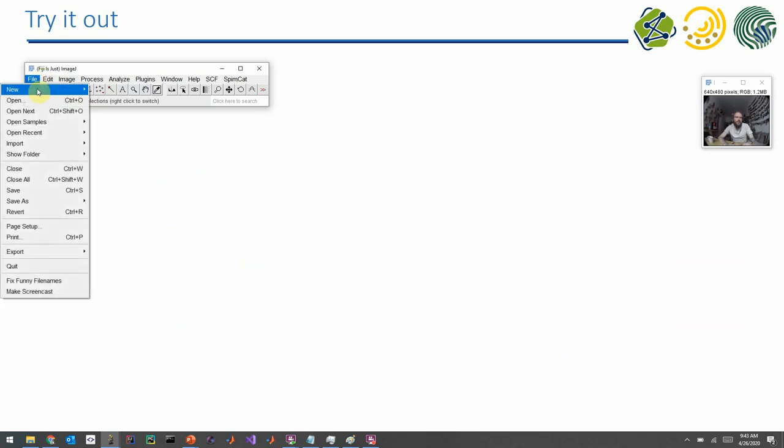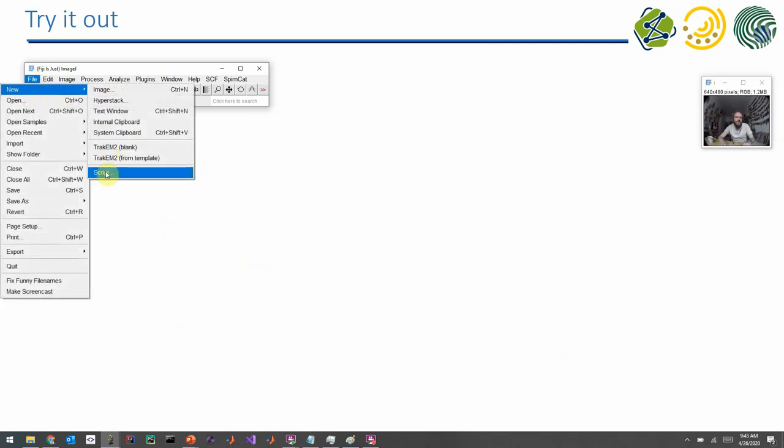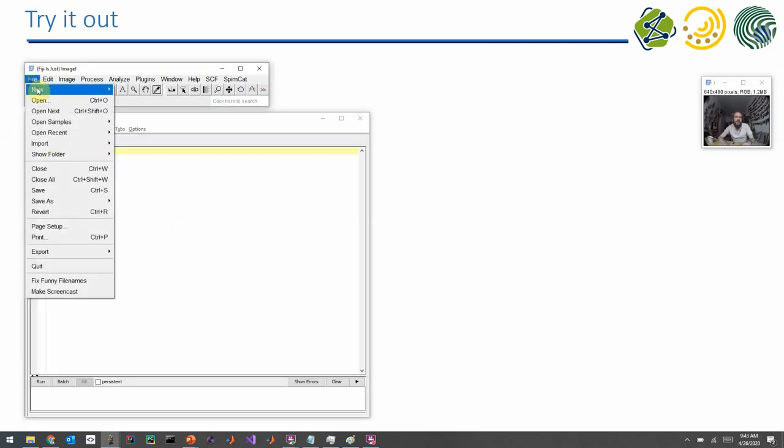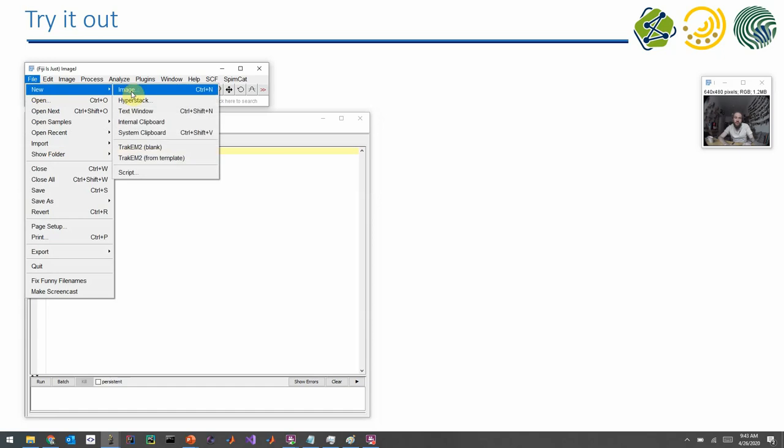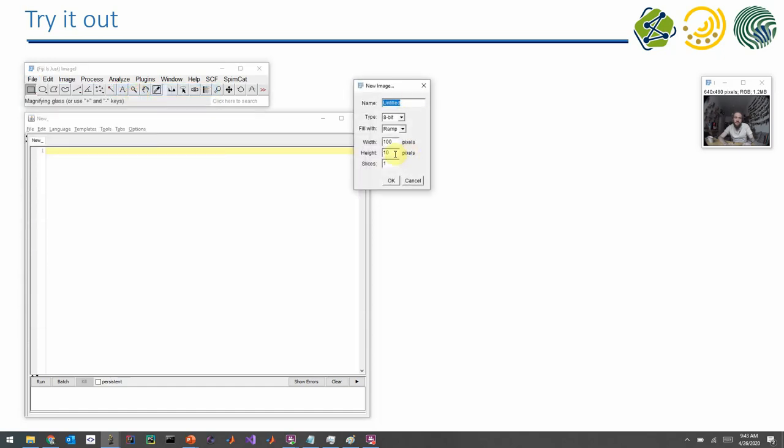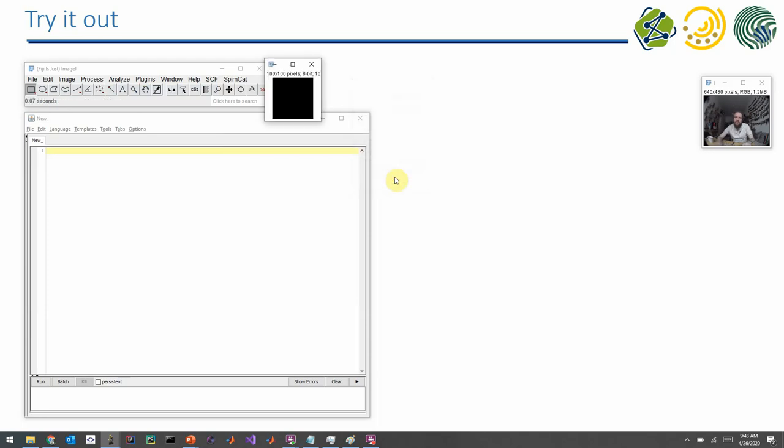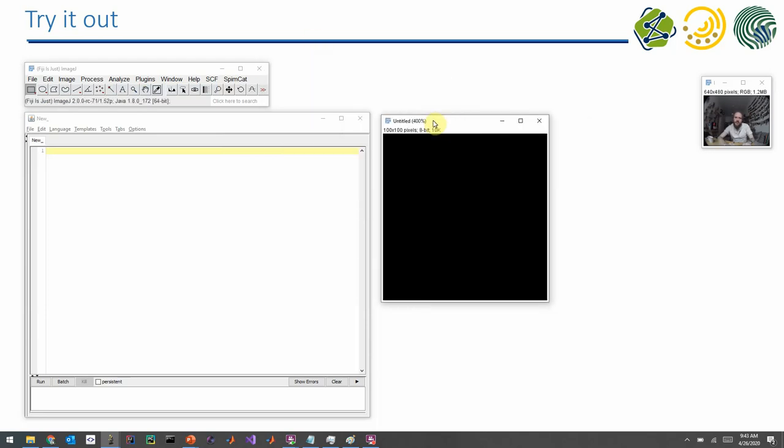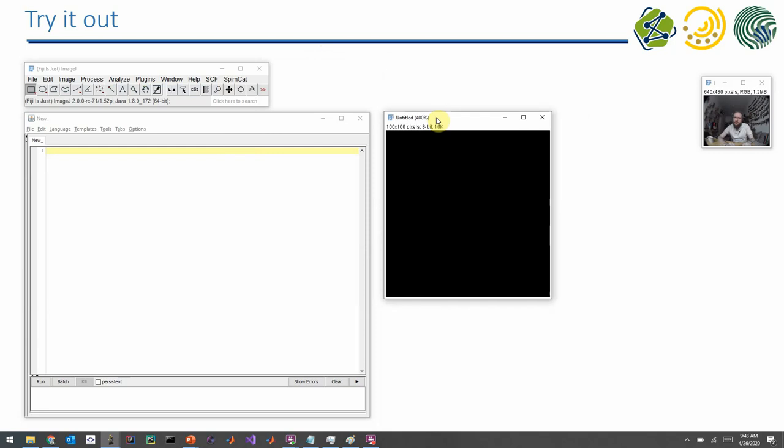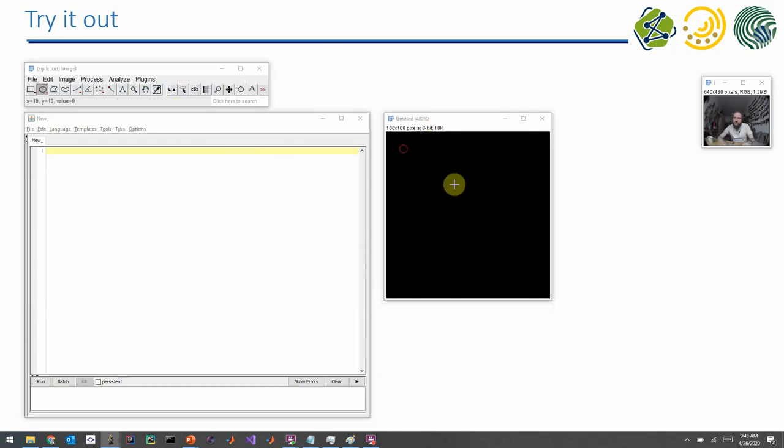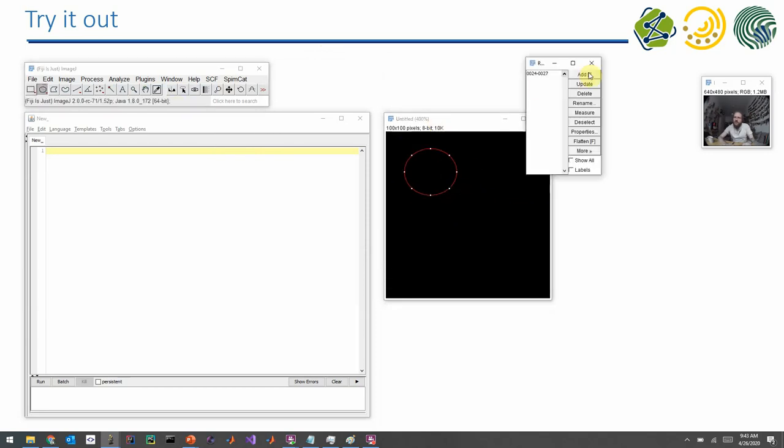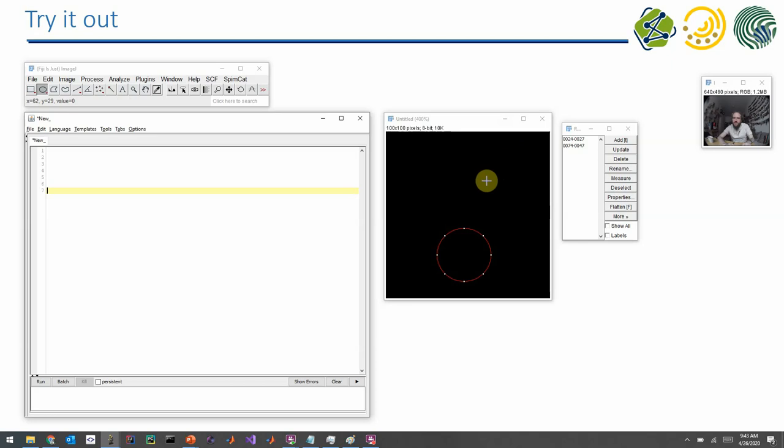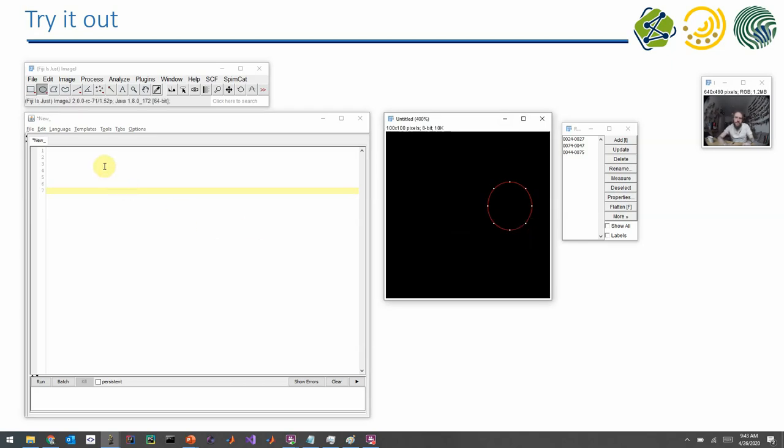Okay, let's try that out. So I start with a new script, and I start with a new image. For example, 100 times 100 pixels, black. And I basically repeat what we did in the first exercise. I draw a circle, I add it to the ROI manager. I draw another circle, I add it to the ROI manager. Maybe I add a third one.